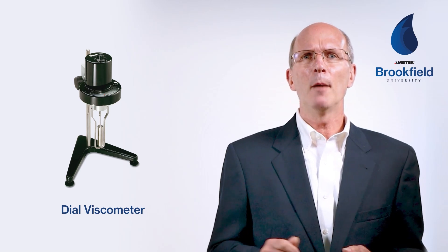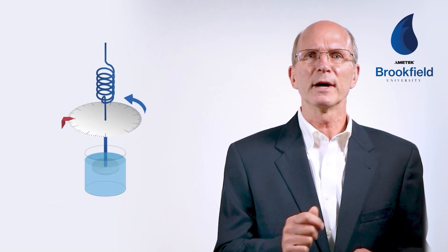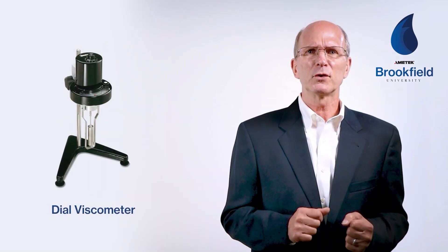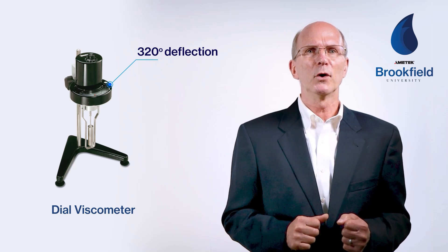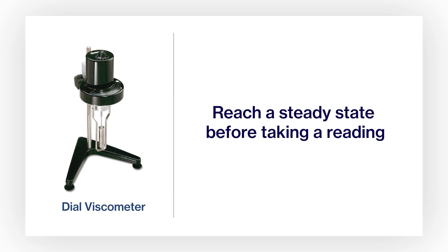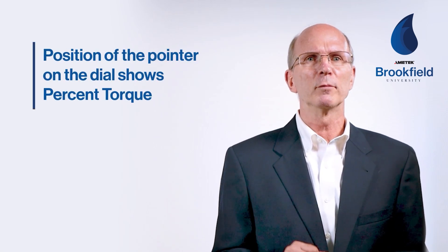In the case of the dial viscometer seen here, a pointer is attached directly to the spring and moves with the spring as it is deflected by the viscous drag of the sample on the spindle. The dial pointer travels almost 320 degrees from 0 to 100 on the dial face. When using a dial viscometer, we recommend waiting for five revolutions to reach a steady state before taking a reading. Once the spring is stabilized, the position of the pointer on the dial will show a percent torque from 0 to 100.